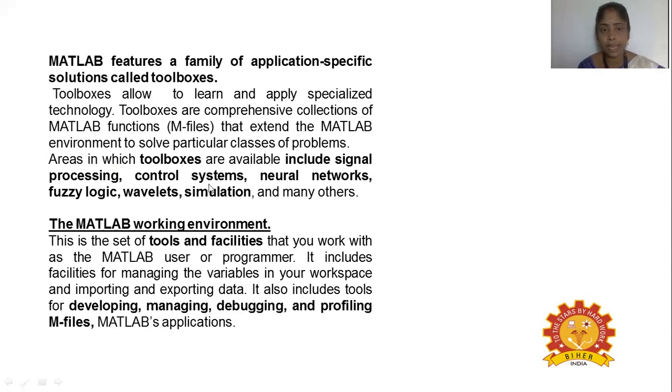In the same way it can be done for pH, or for oxygen if needed, or if the foam level goes beyond the limit, we have to add antifoam. Everything can be controlled or sensed by the signal, and then it is controlled by neural networks with the help of a toolbox. So how does it work in the environment? This is the toolbox and the facilities that have to be used by the MATLAB user or programmer.